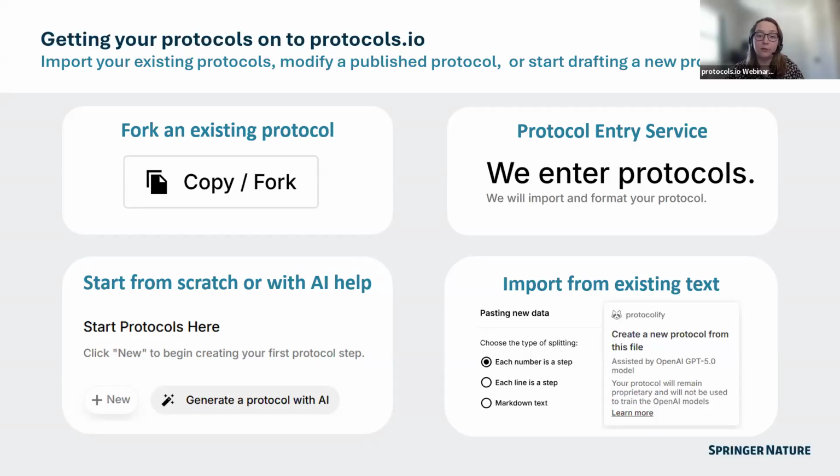Or you can import from existing text either by copying and pasting text in or using our Protocolify AI importer, which is able to take any files in any format, like a picture of a handwritten protocol, a PDF of a protocol that you have in the lab, a Word document, and so on, and transfer this onto protocols.io and convert it into a step-by-step protocols.io format.